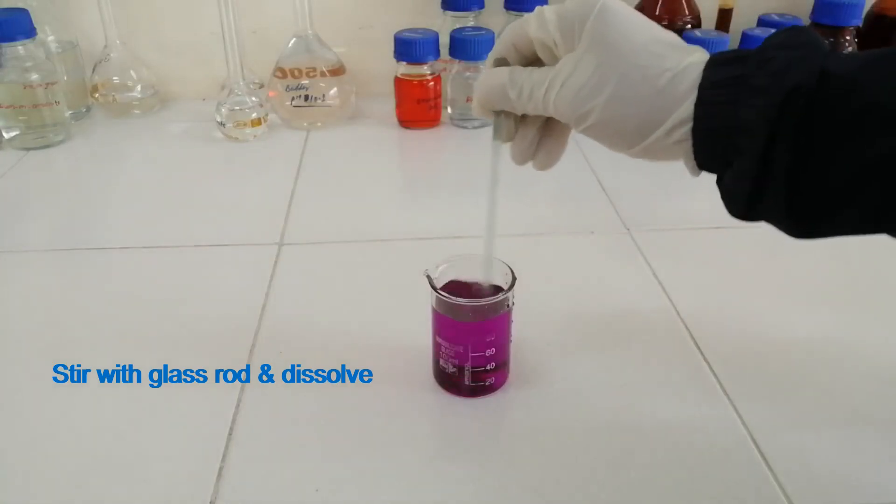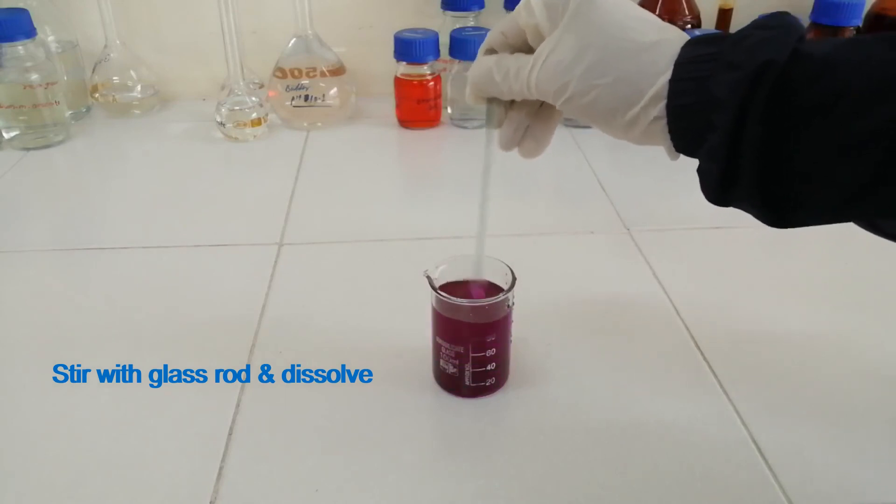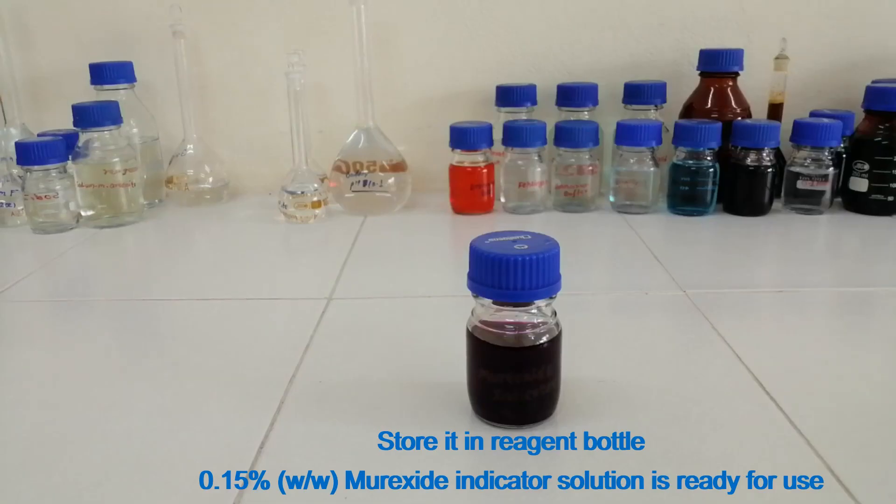Stir with a glass rod and dissolve. Store it in a reagent bottle. 0.15% murexide indicator solution is ready for use.